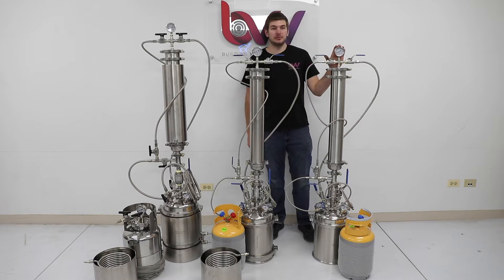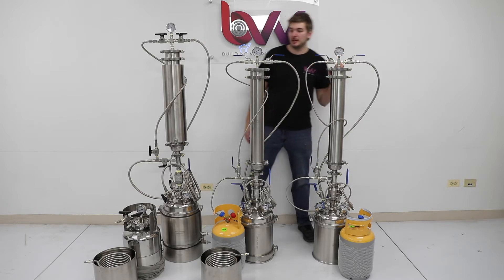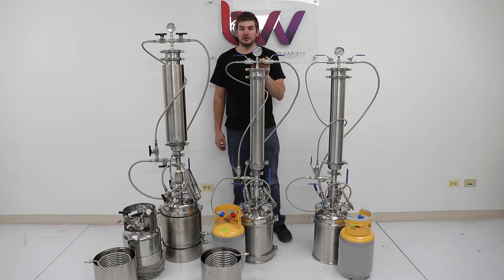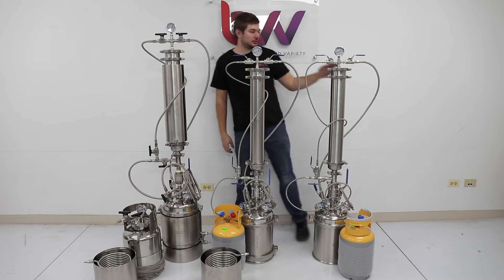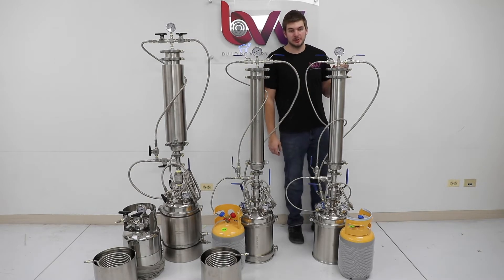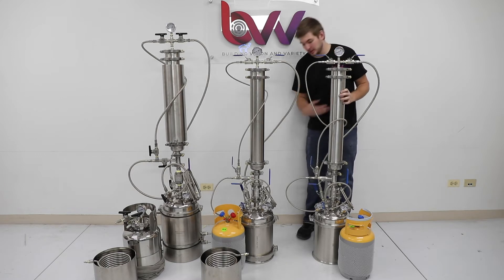The first one on your right is going to be our Explorer model. It's our base model and nothing fancy added to it. In the middle we have our Professional model and then to the left we have the Elite model. Going back to the Explorer, a couple of key features: it has a standard material column with no jacket of any sort, same with the base.